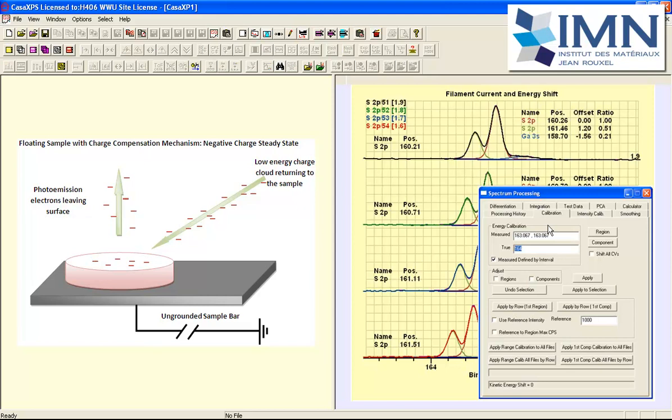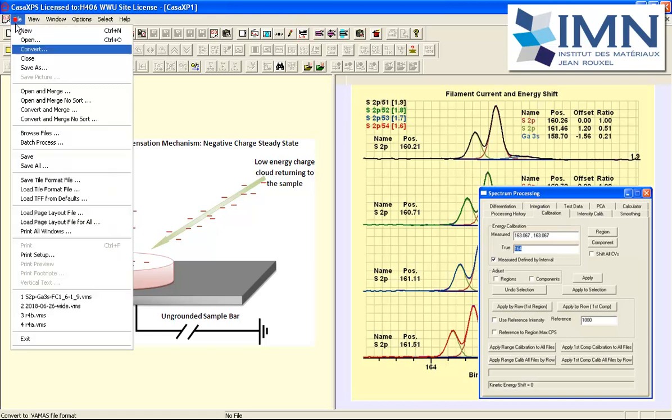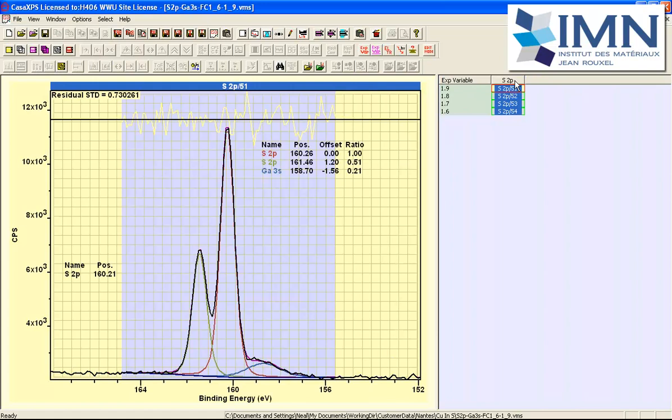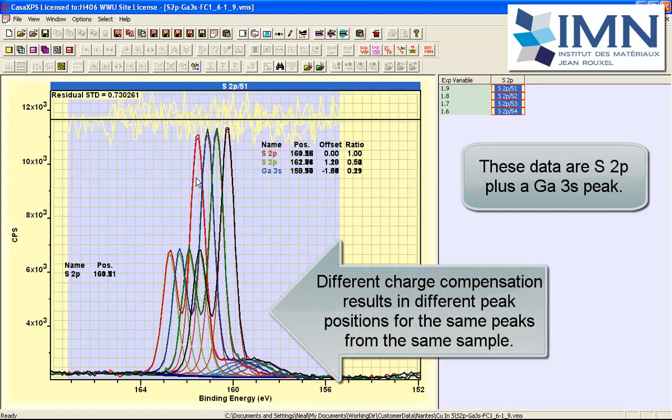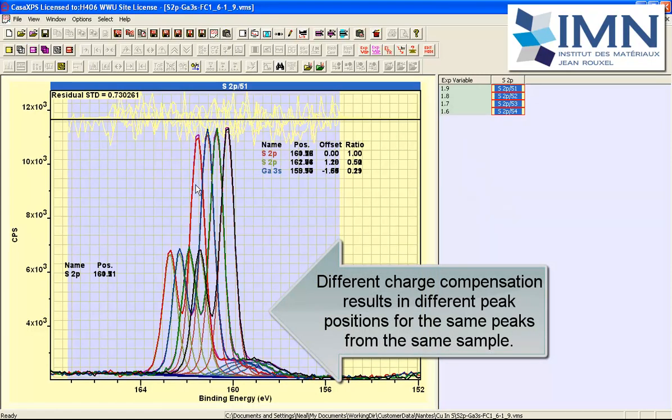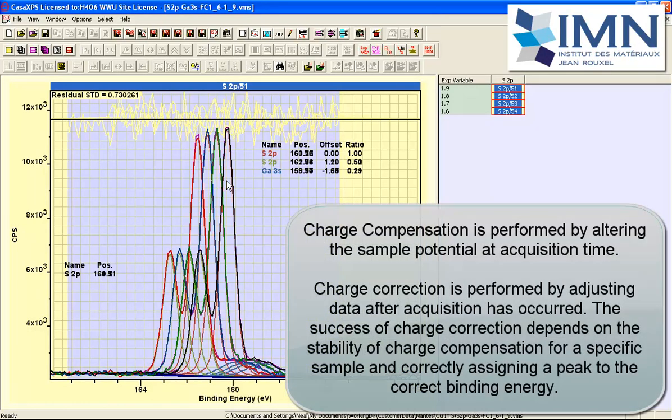We will now illustrate how this calibration property page works in the most basic form. In order to do this we will load the data file that corresponds to these spectra that you see in this image. These are a set of sulfur 2p spectra that were measured from the same sample using different charge compensation conditions and the different charge compensation has resulted in shifts in these peaks.